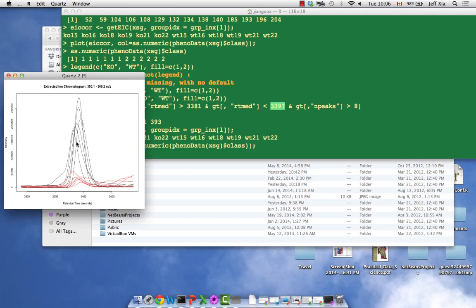So far, any questions? So that's the main reason we want to use XCMS. We can interactively interrogate this data. We really want to see that the peaks we found interesting are there. And if you use MetaboAnalyst or even XCMS Online, it doesn't allow you. Basically, whatever peaks are peaks, and you just can't get this. So that's why we want to learn this.